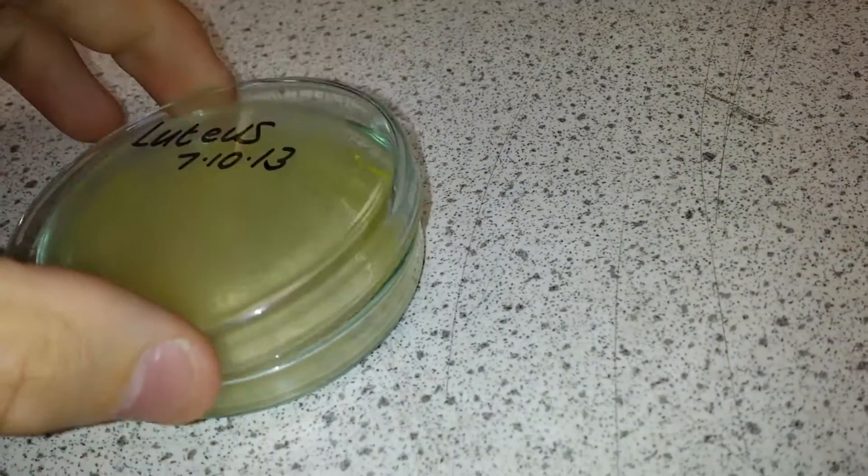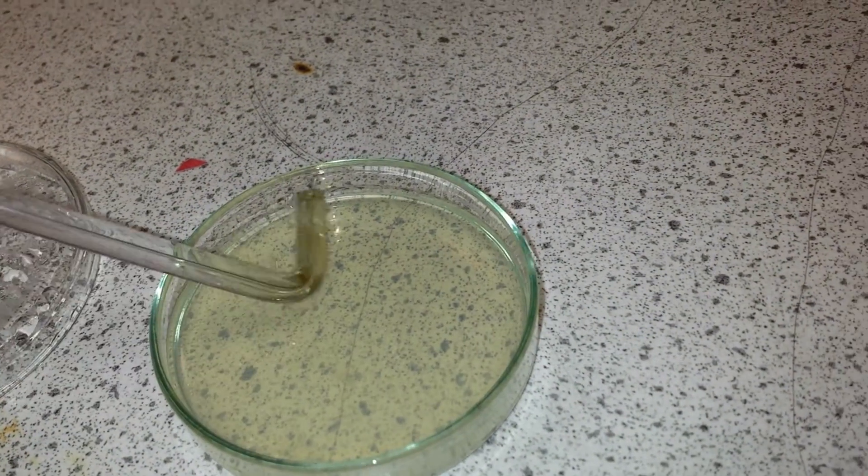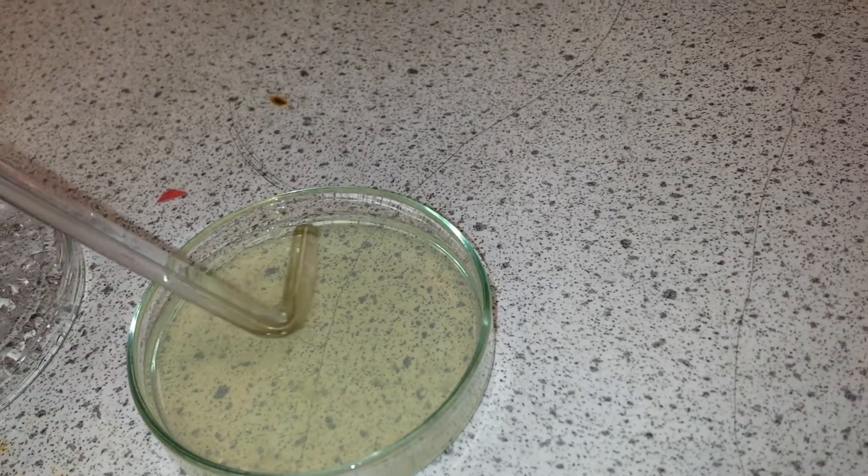We're very careful to put the lid back on the bacteria sample so that it doesn't get contaminated. We then go across to our agar jelly dish and smear it evenly all around.